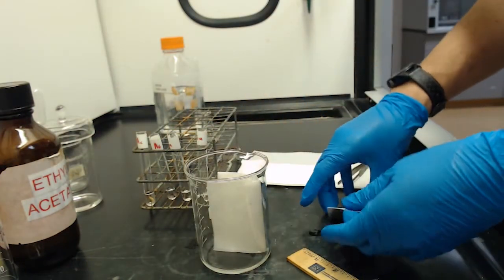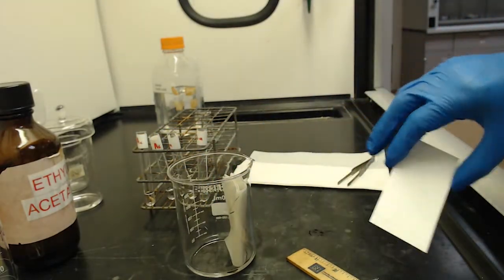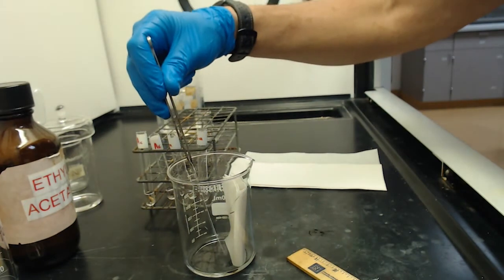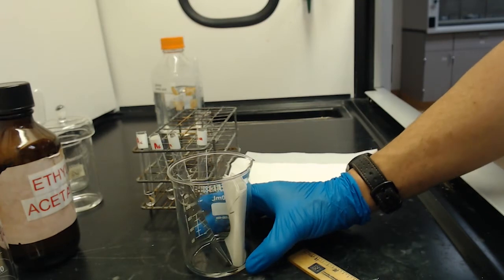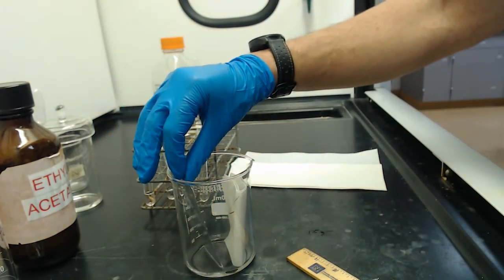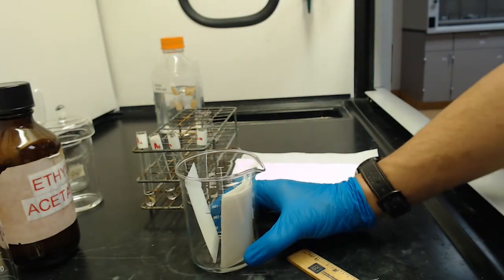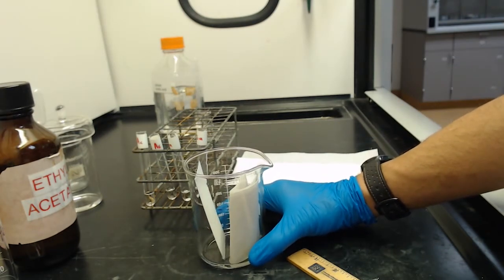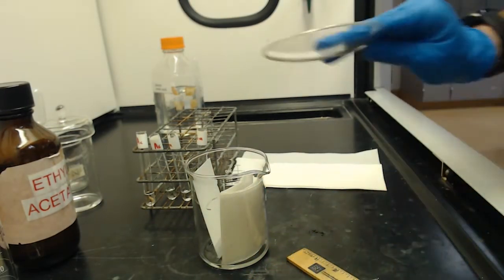This part, you've got to be careful here. You don't want the plate touching the paper towel. So I'm going to use some forceps, tweezers, and put it in here. Kind of want to just prop it in there so it's not touching the paper towel as best you can. I think I'm epically failing at that right now. Yeah, I think, nope, it's not touching. I'm not sure you can see on the camera, but they're actually not touching. So I'm going to turn it a little bit this way so we can watch it climb, and then don't forget you have to cover it with a watch glass.